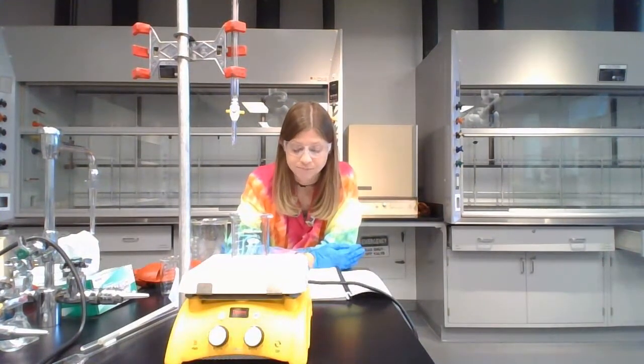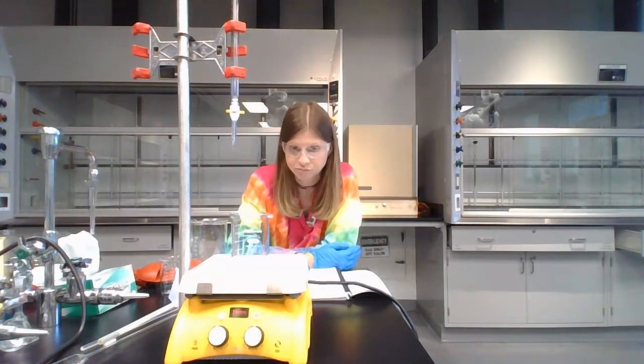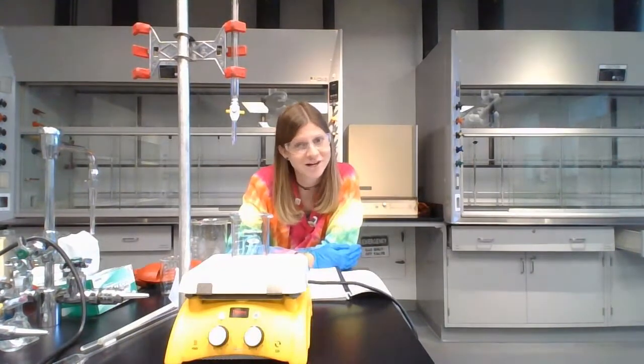Okay. Wear old clothing for this lab. If your clothes get potassium permanganate on them, you will be asked to take off those clothes and put on something different. We will have scrubs, some loose-fitting things that you can change into, but if you're really concerned about it, having a backup shirt or a backup pair of pants is not a bad idea. This is not something that happens commonly, but it has happened enough times that it's worth mentioning.